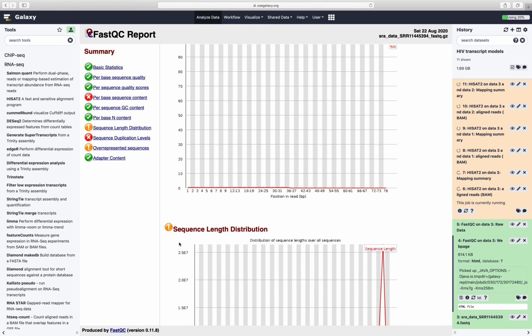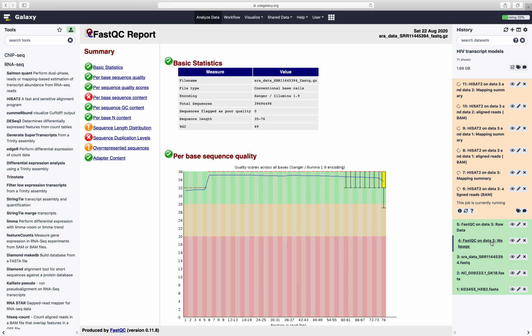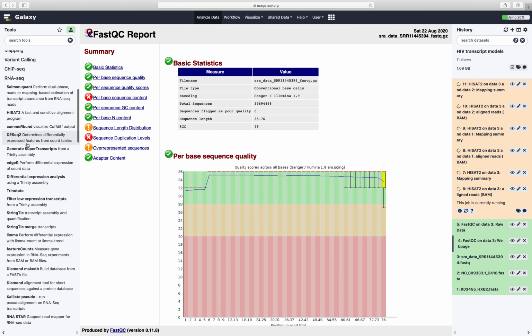So overall, based off of this QC report, I know we jumped into these analyses earlier, but based off of the QC report, this sample that we're working with is okay. We're still waiting on this HISAT stuff to run. I just want to, what is this?